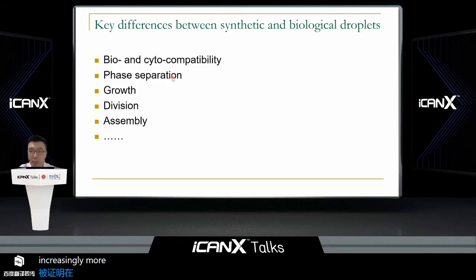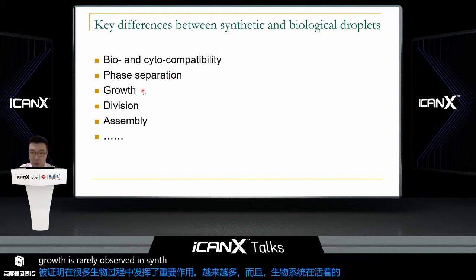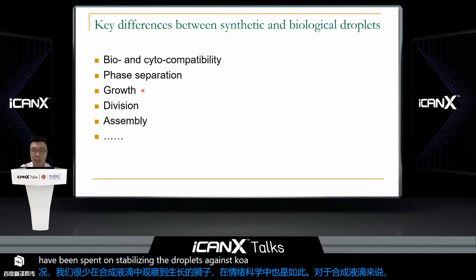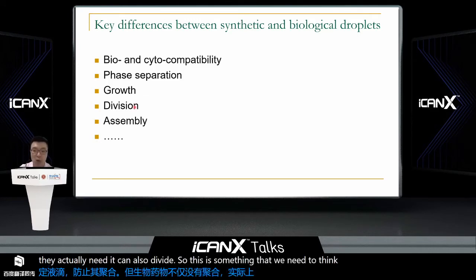Moreover, biological systems obviously exhibit growth when they are living, but similar reliance on growth is rarely observed in synthetic droplets. Also, in emulsion science for synthetic droplets, a lot of effort has been spent on stabilizing the droplets against coalescence, but biological droplets do not only not coalesce, they actually, if needed, can also divide. So this is something that we need to think about if we want to replicate that in synthetic droplets.